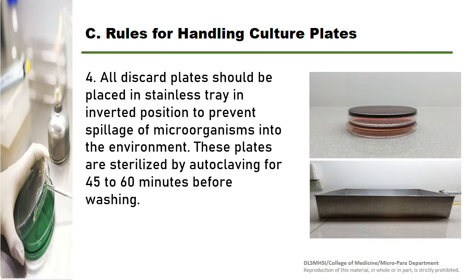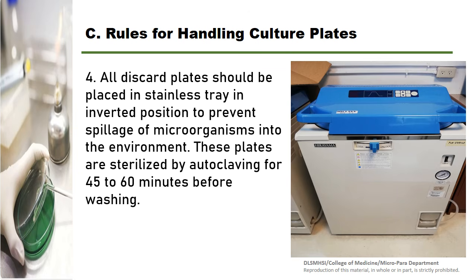All discarded plates should be placed in a stainless tray in inverted position to prevent spillage of microorganisms into the environment. These plates are sterilized by autoclaving for 45 to 60 minutes before washing. So there are different types of autoclaves. So this is what we use in the laboratory.